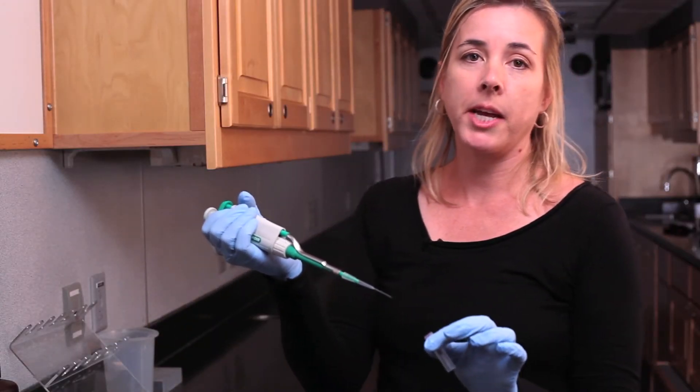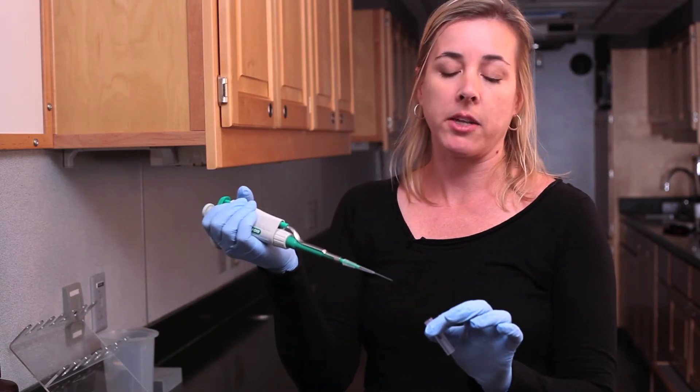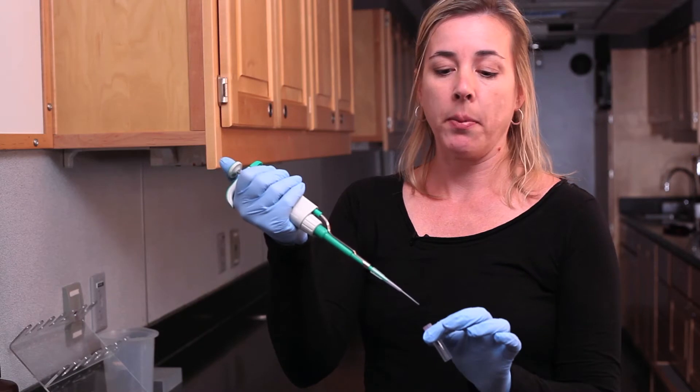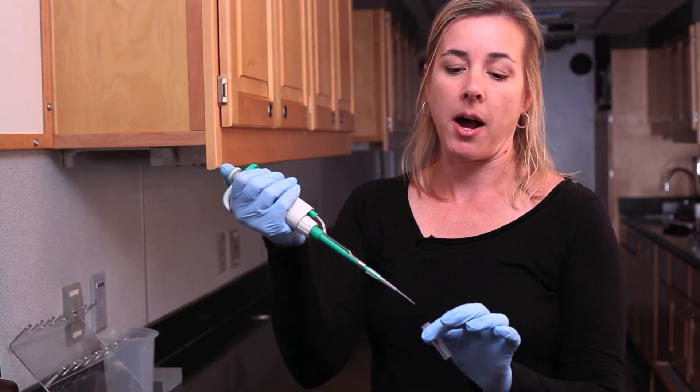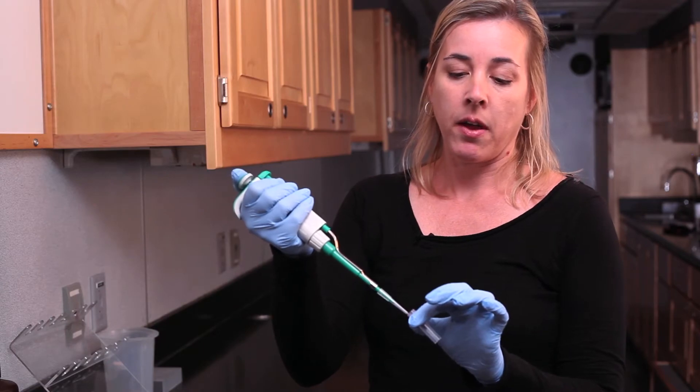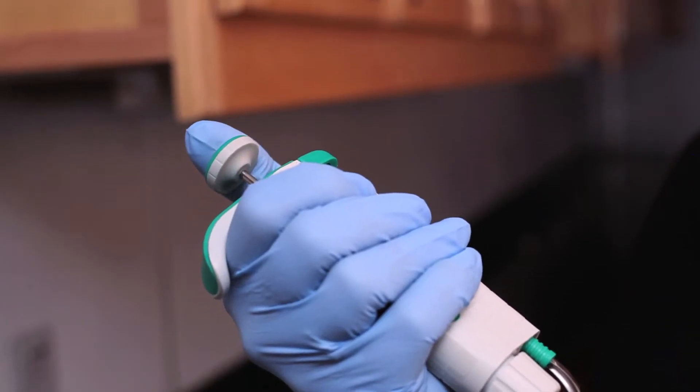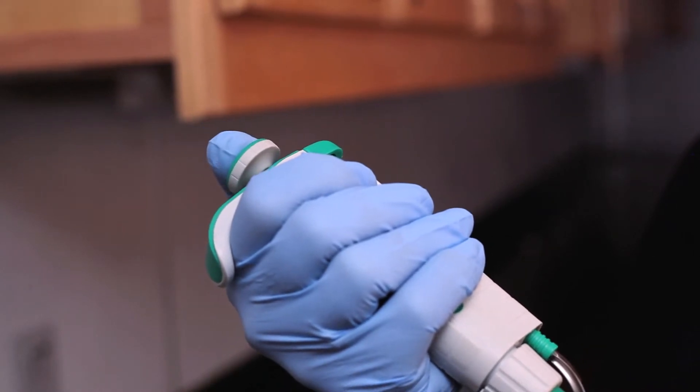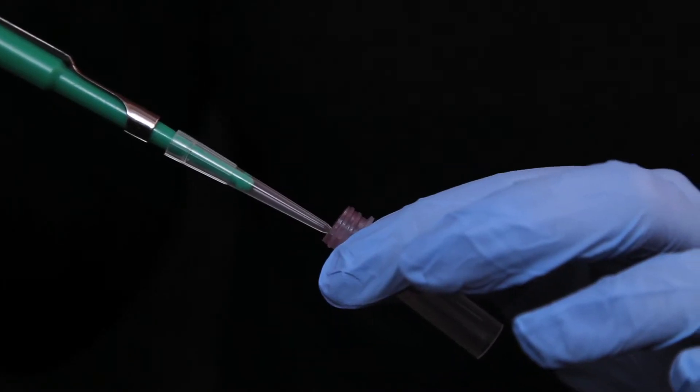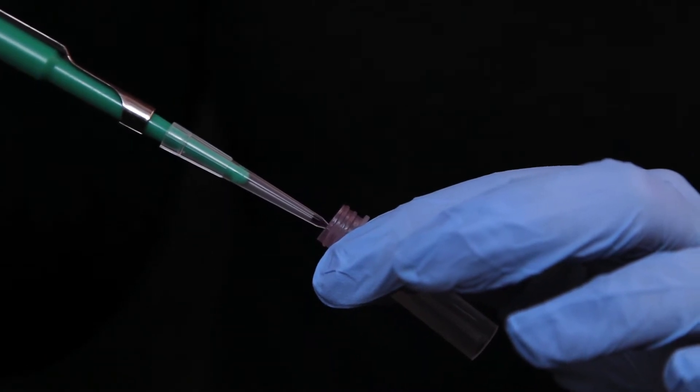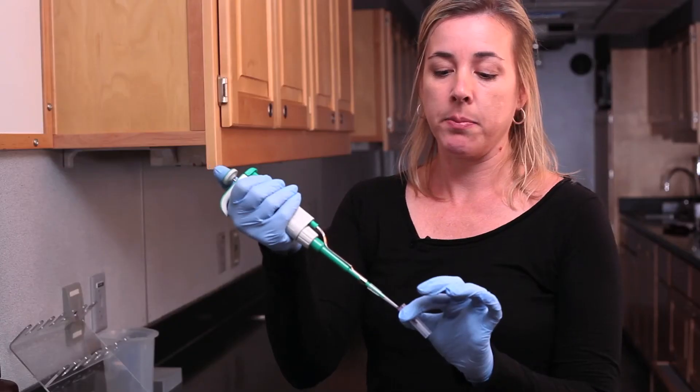Before we load our sample onto our gel, it's important that we mix our sample. So I'm going to take my thumb, place it on the plunger, and press down to the first stop. Then I'm going to enter my sample and release my thumb to collect the sample, but then I'm going to press back down to the first stop. And I'm going to do this several times, just moving back and forth between the first stop and the release to mix my sample.